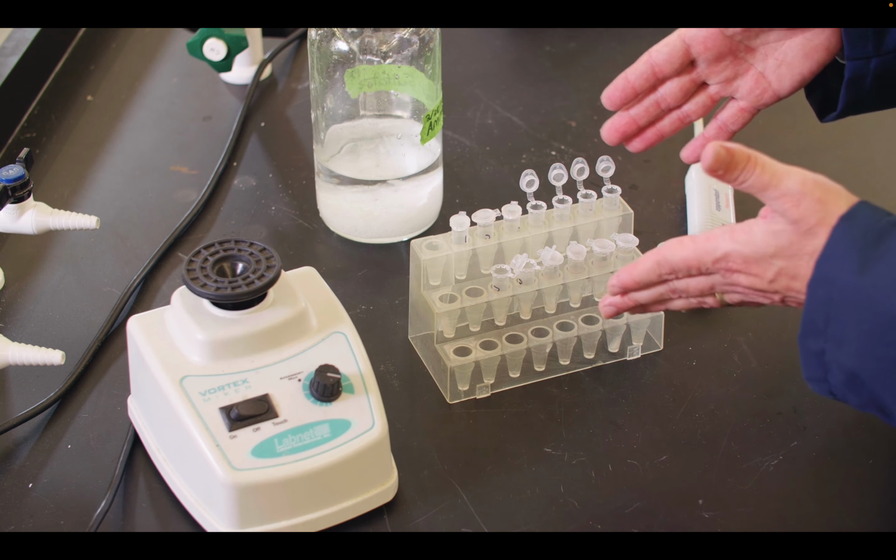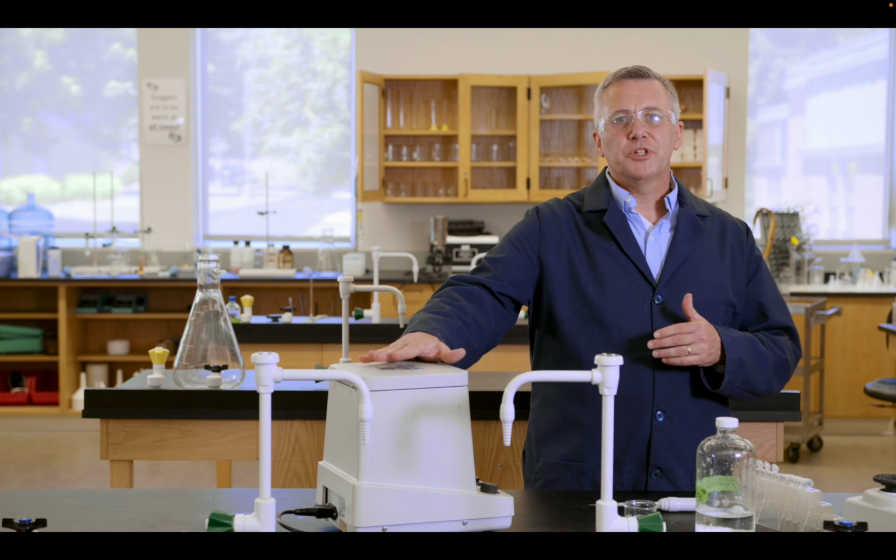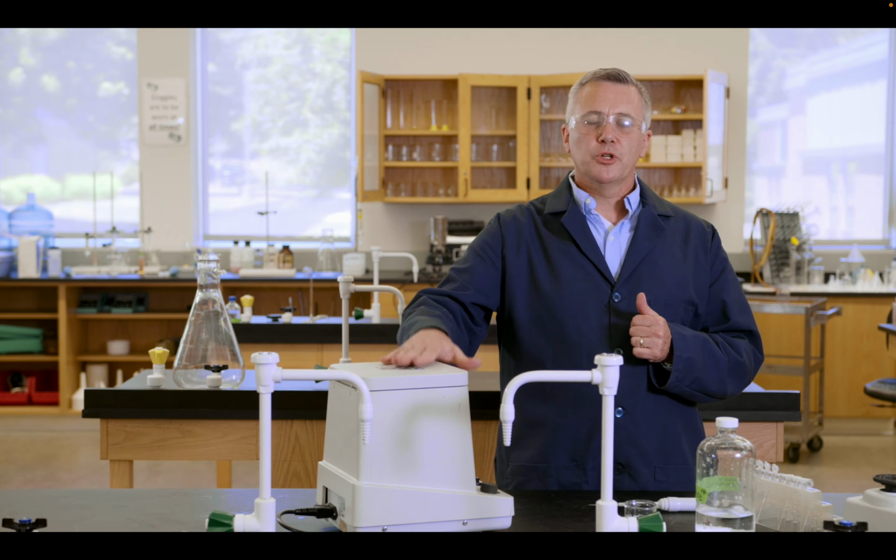And then once we finish that, we're going to incubate them on ice to make sure we cool and allow anything to precipitate. And then we'll centrifuge them in a microcentrifuge to recover the pellet. Right? So I'll show you those results in a second.